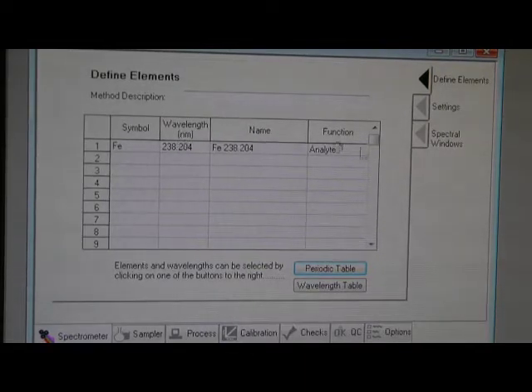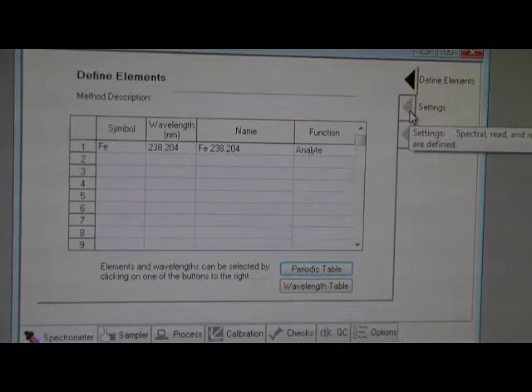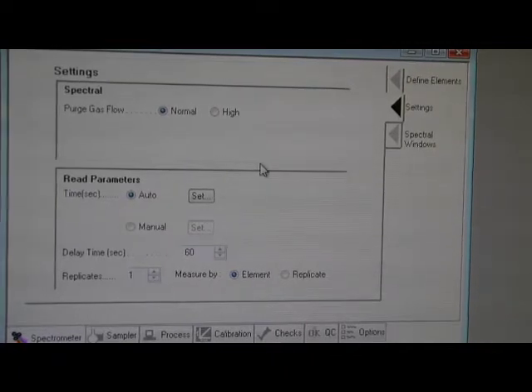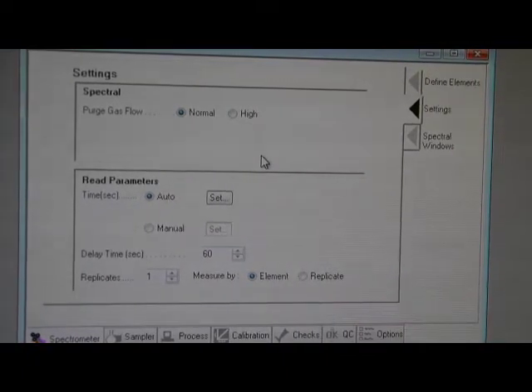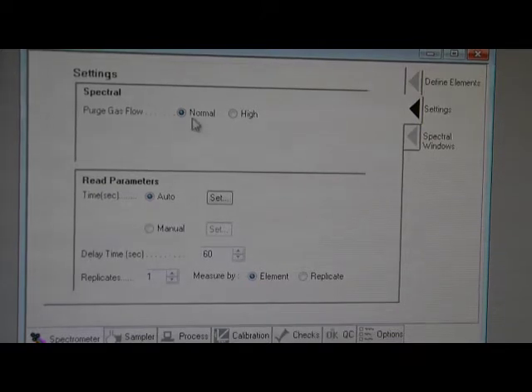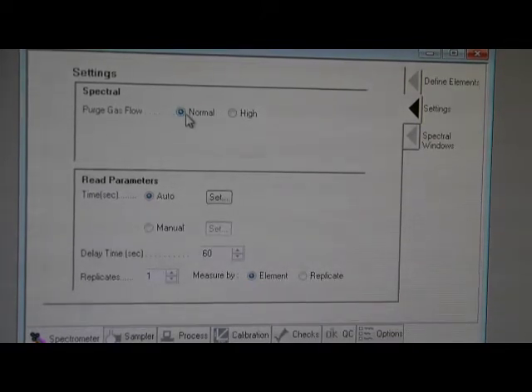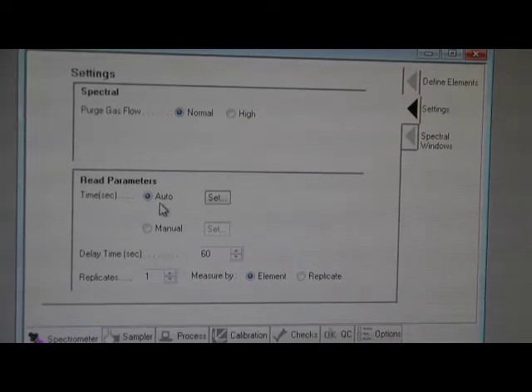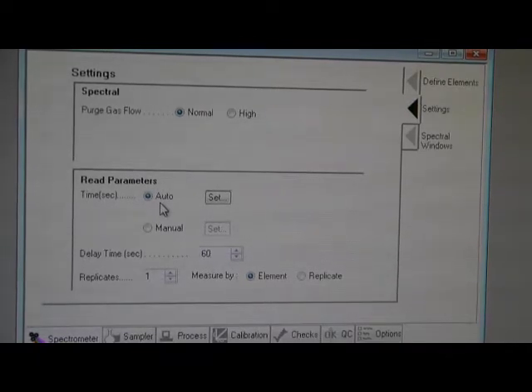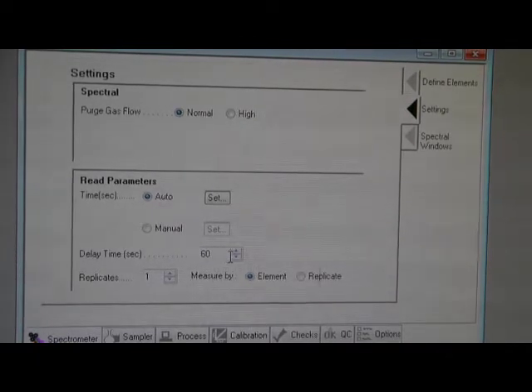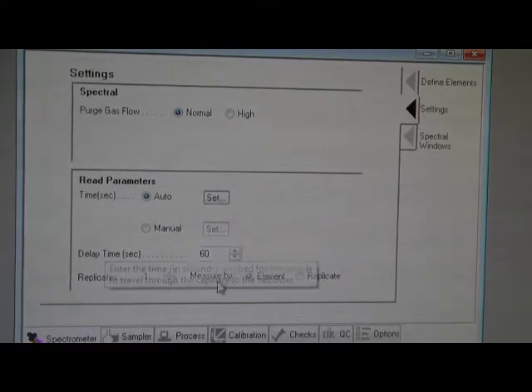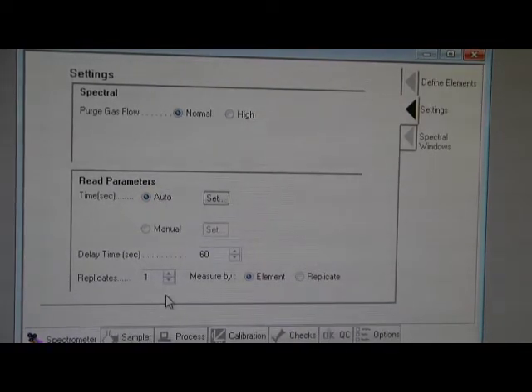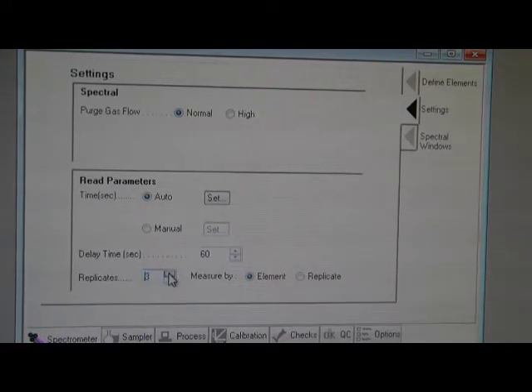Next one, you can go to the setting. You follow the instruction from the menu. Choose the purge gas: normal. Time: auto. Delay time: 60 seconds. And replicate: choose 3. And measure by element.